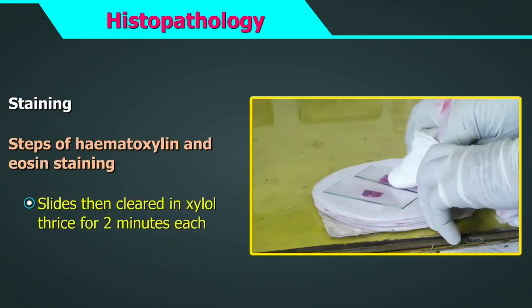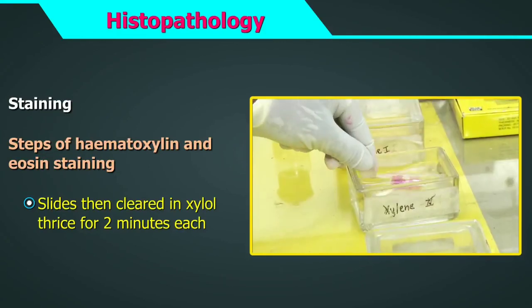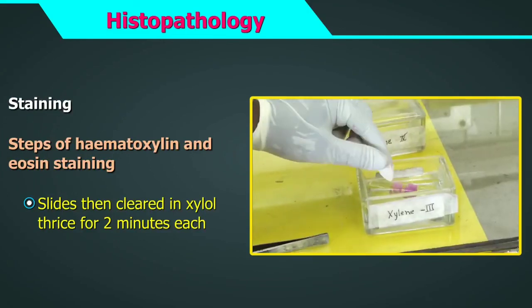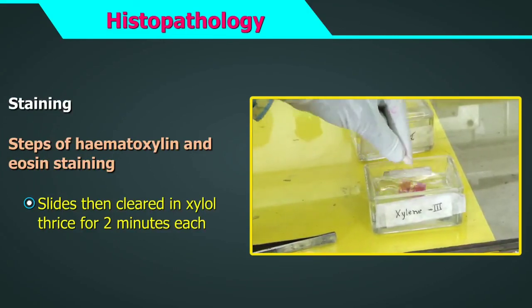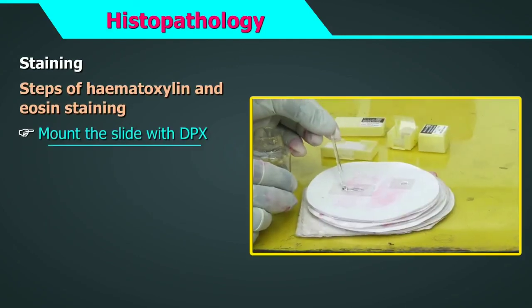The slides then need to be cleared in xylol. This is done thrice for 2 minutes each. Gently wipe the back of the slide and around the tissue section after each change. Now, mount the slide with DPX.